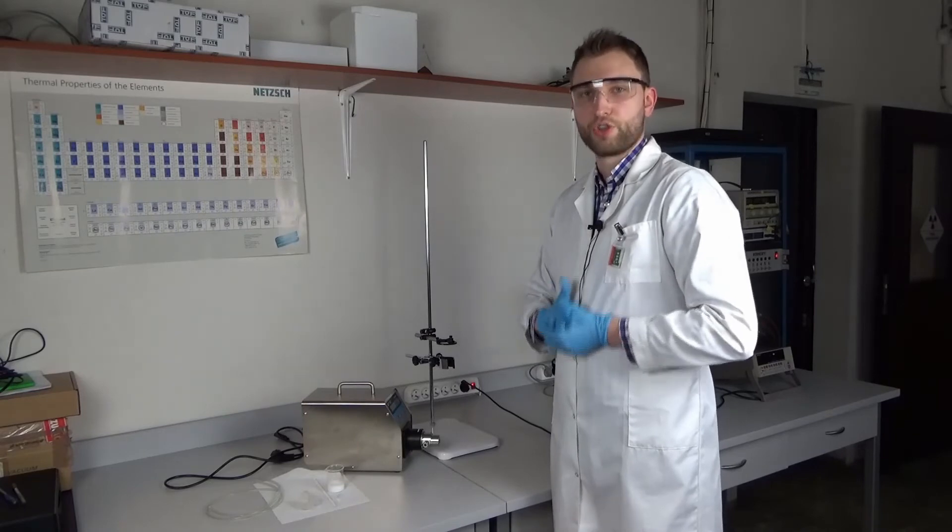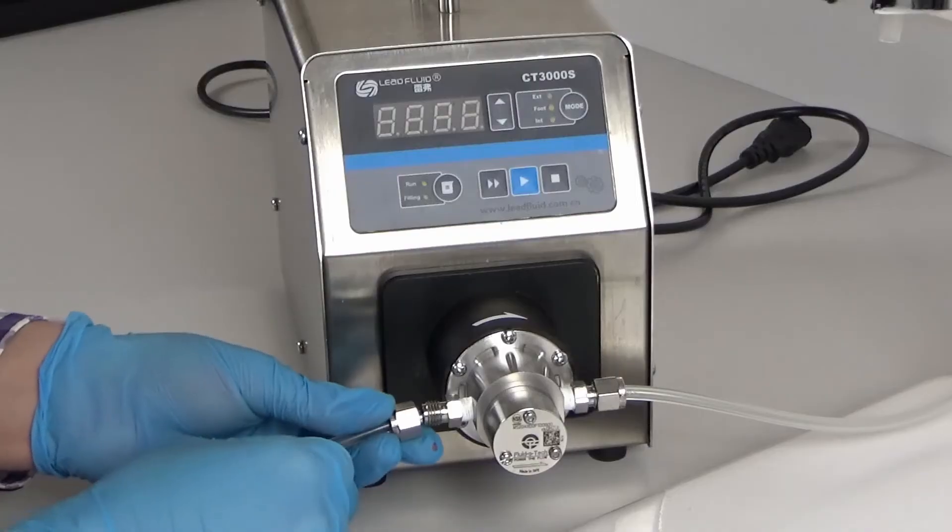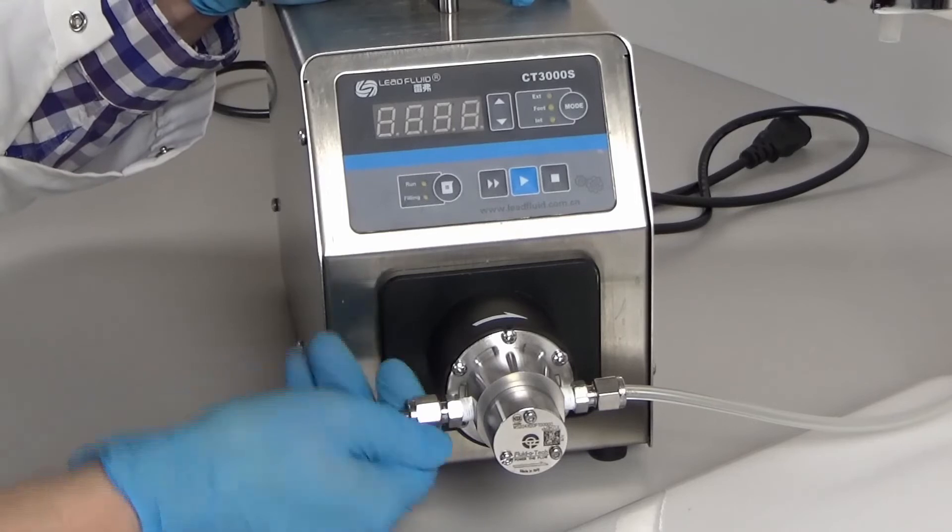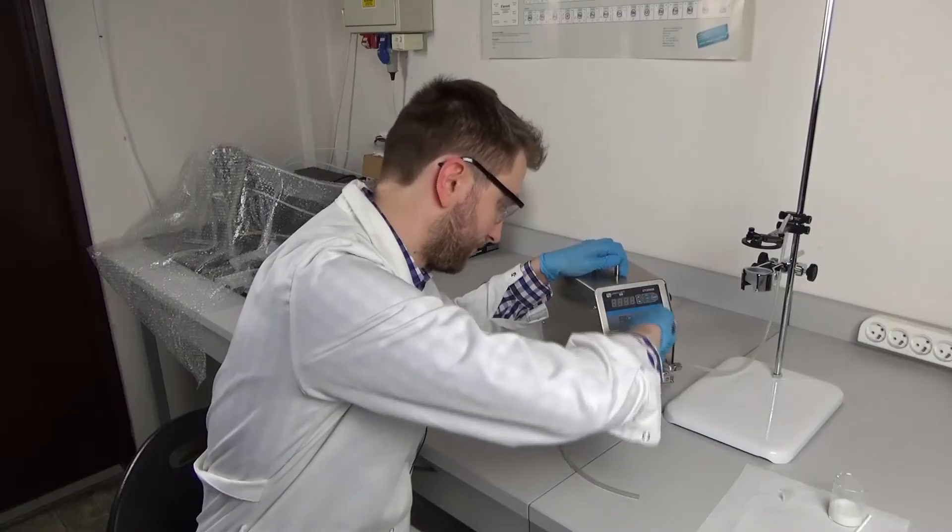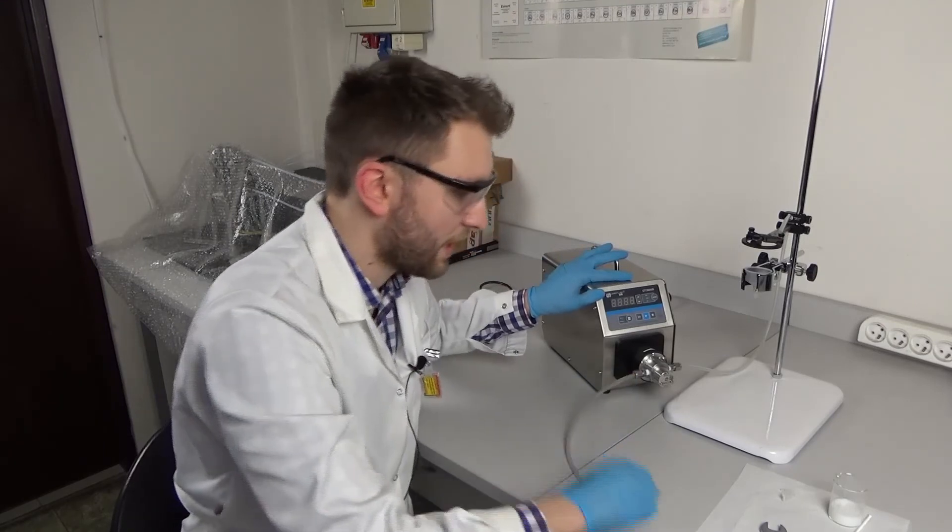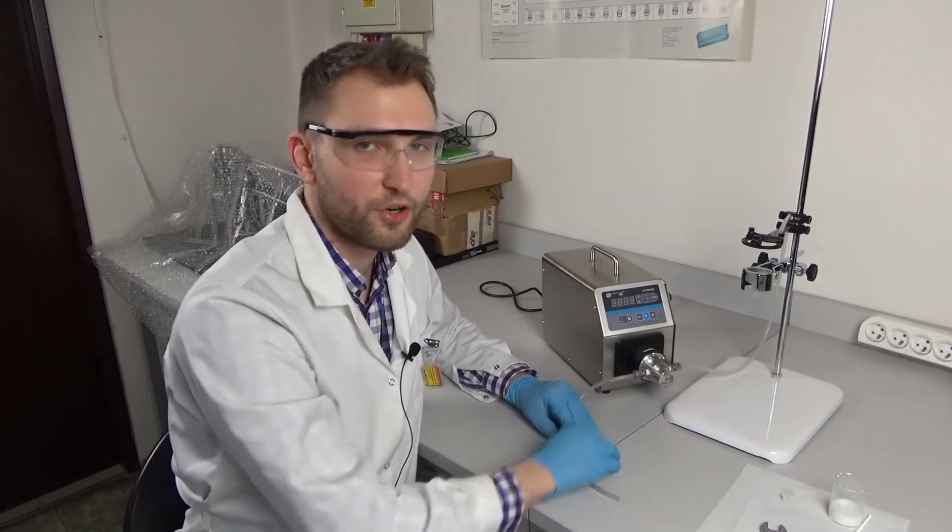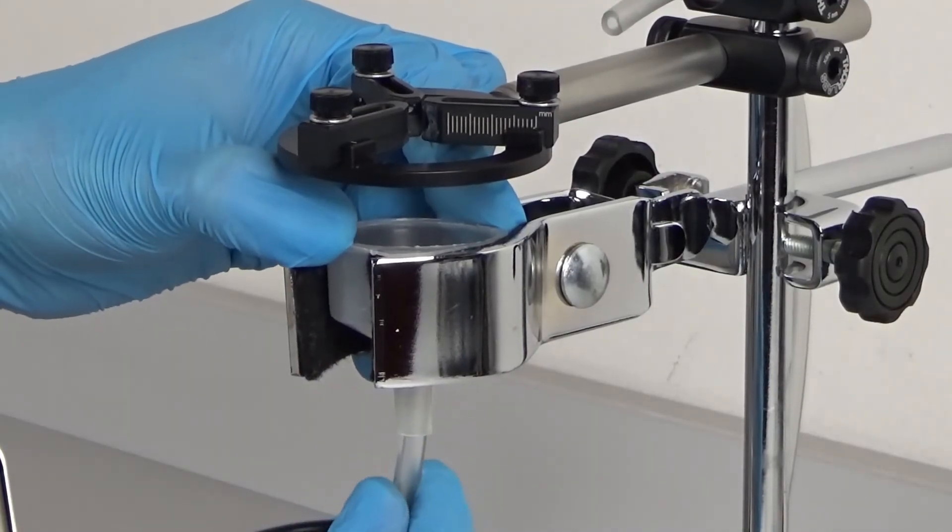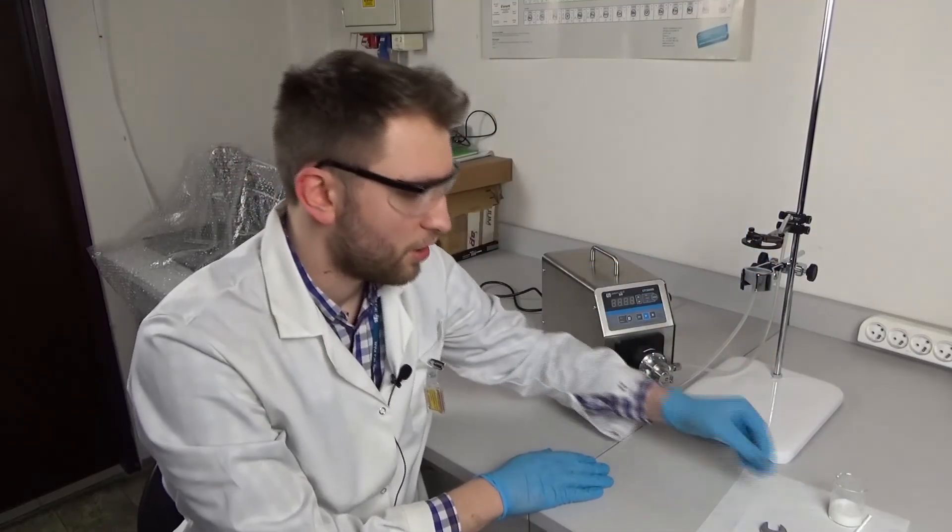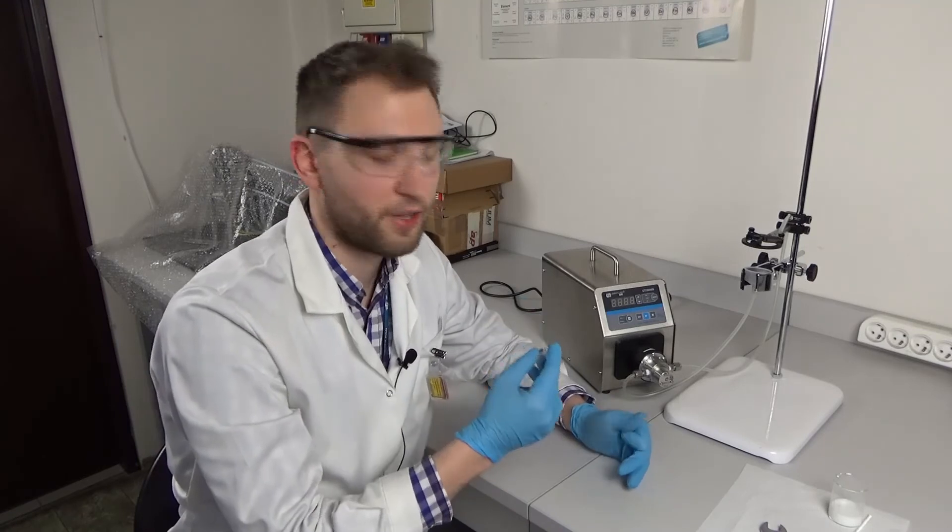So let's assemble all the parts. The first thing I'm going to do is to connect the pipe to the head pump through the so-called Swagelok system. Let's make sure that the pipe is sitting tight. Good. So now I will connect one end of the pipe to a funnel and the other to the nozzle. Here it's just a simple connection. When connecting the nozzle to the pipe, I need to be very careful because if I push too hard, the nozzle might break.